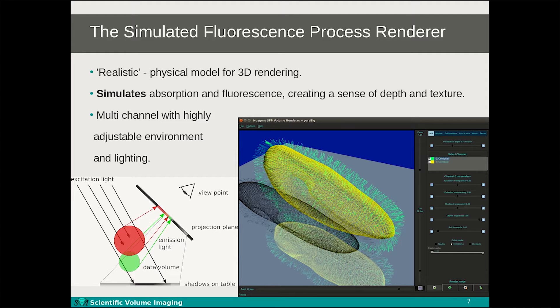Next up we have the simulated fluorescence process renderer or SFP renderer. This renderer interprets an image as a distribution of fluorescent material which can absorb light and then re-emit it at a different wavelength. The excitation light rays are absorbed by the material, attenuating the light intensity based on the local density and the excitation transparency of each material. The extinguished light forms natural shadows both inside the object itself as well as on the virtual table placed beneath the object. Once absorbed, the light is re-emitted from the different materials and may again be absorbed based on the emission absorption transparency. All in all this physical simulation leads to a realistic sense of depth and texture.